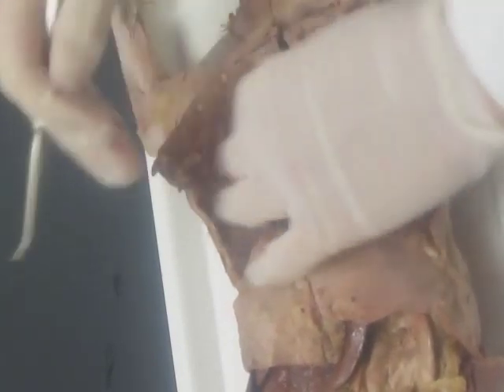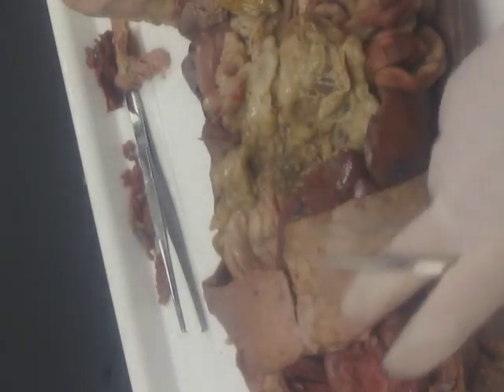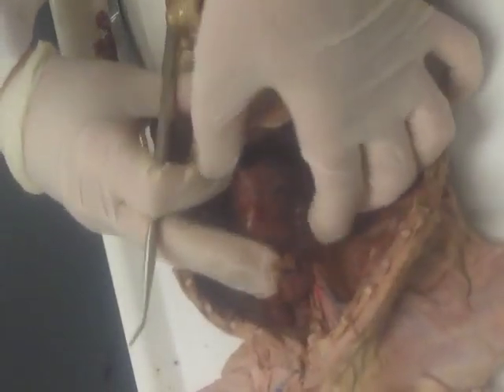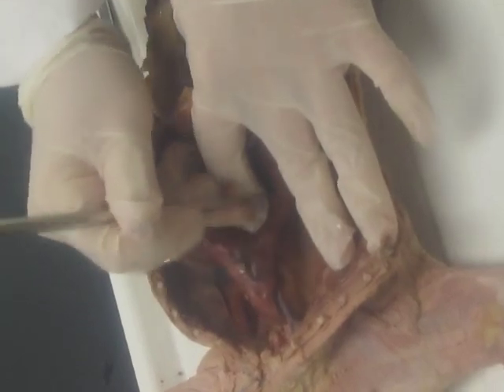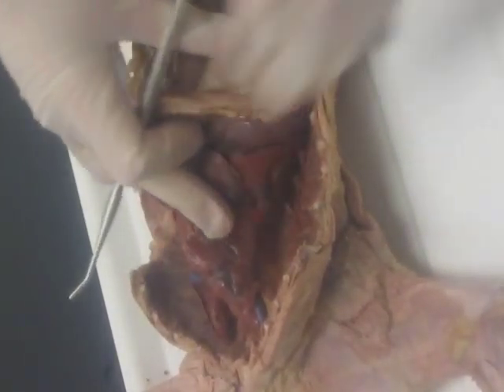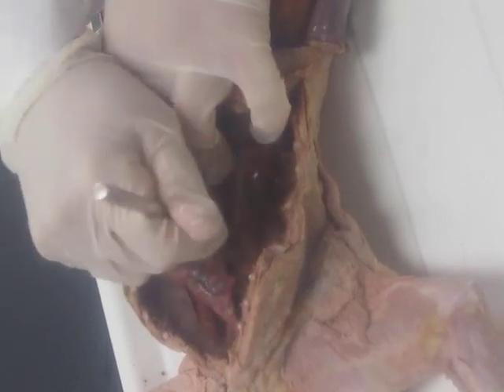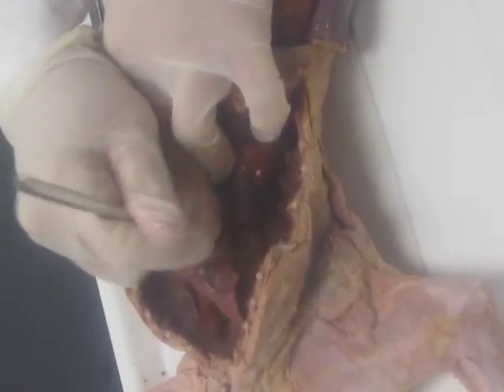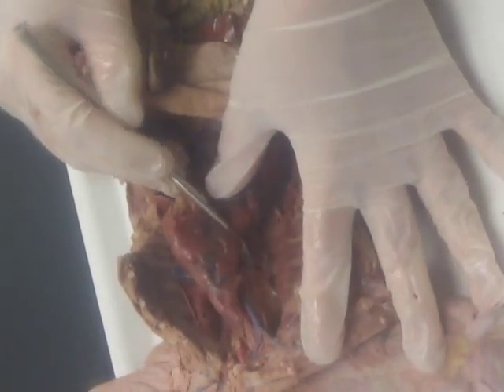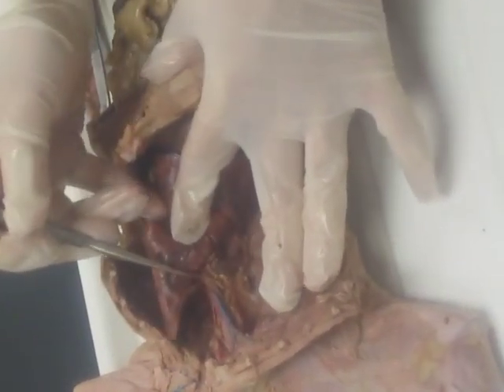Now we're going to do the azygos. The azygos is under the right lung. Lift the right lung all the way back and remove the same mediastinal pleura. Here's the superior vena cava. The azygos is going to be a large blue vein running along the right side of the thorax — it drains blood from the intercostal vessels and so forth. Here it is: this big blue branch called the azygos coming away from the superior vena cava.